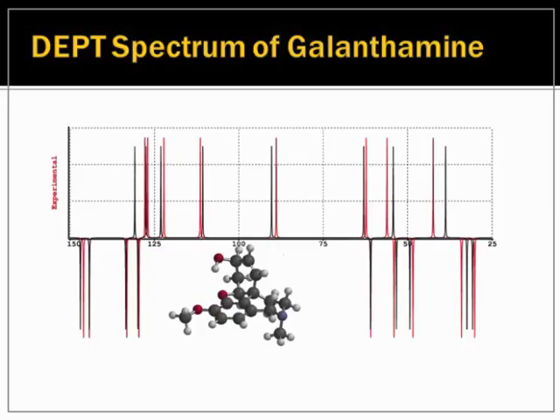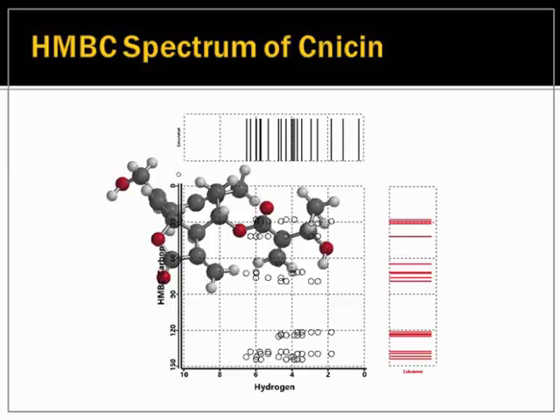For example, you can take some object and you can do a DEPT spectrum. We're not doing a different experiment. We're simply saying, I know what kind of carbon it is, so simply writing the lines differently. In the case of 2D spectra, they don't exactly look like what you measure experimentally because the experimental ones have all sorts of variations due to you're playing different conformations, you're averaging. We're not doing that. But you can actually develop lots of different permutations that experimentally would be different experiments.